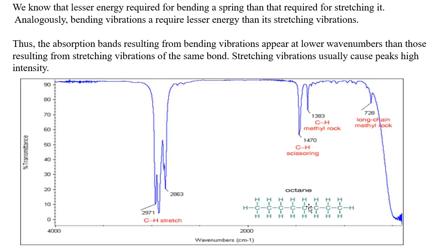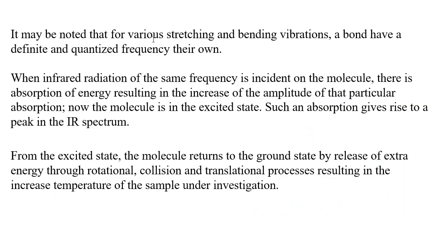It may be noted that for various stretching and bending vibrations, a bond has a definite and quantized frequency of its own.